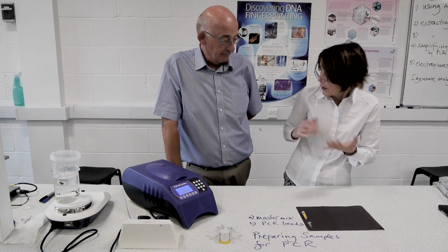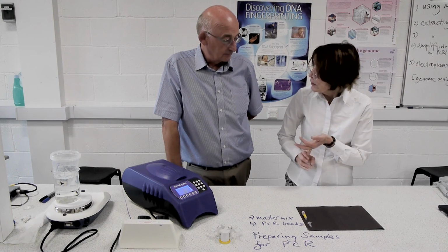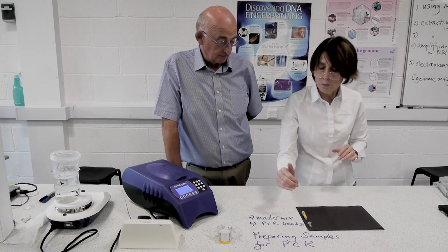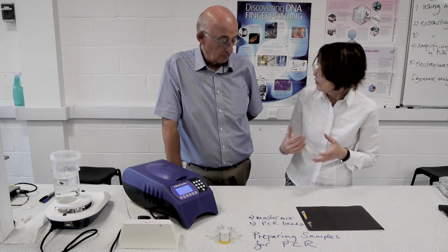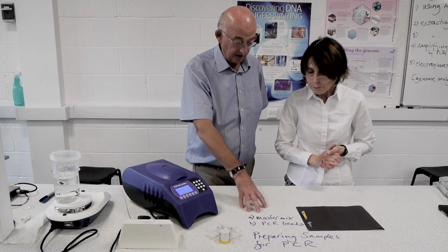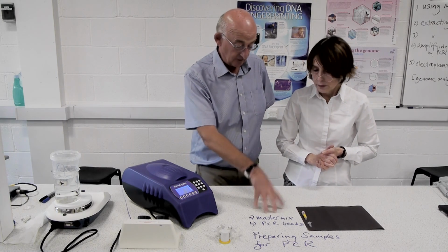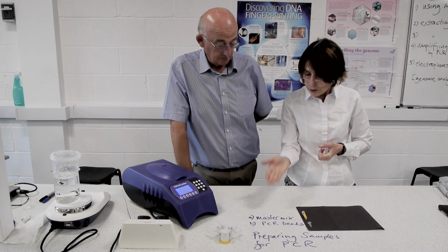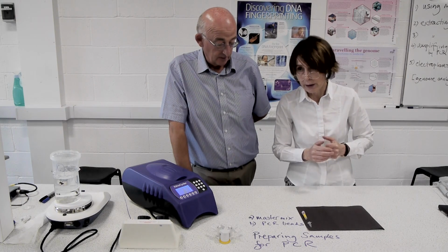Now both contain that enzyme, and both of these also contain the buffers, which give exactly the right pH for the enzyme to work, and also enzyme activators and things like that. What they also both contain are the building blocks for DNA, the nucleotides. Hence the phrase master mix, I suppose, because everything is inside that mix and we just need our DNA sample to be added to be able to amplify. That's right.